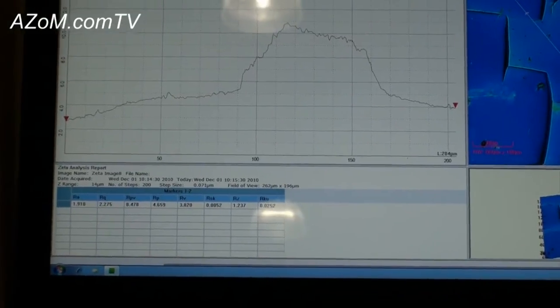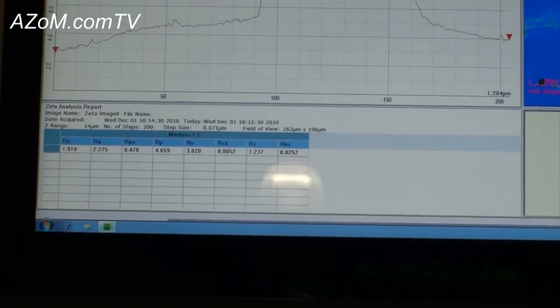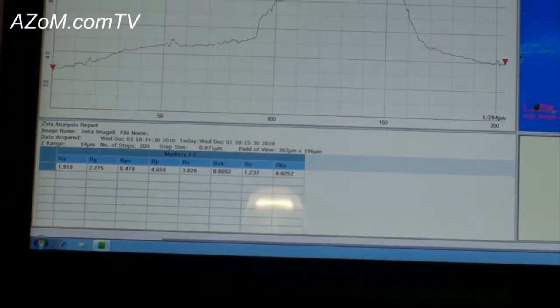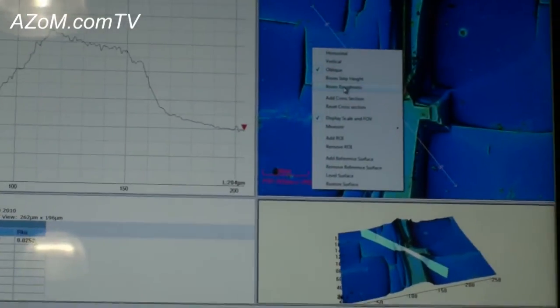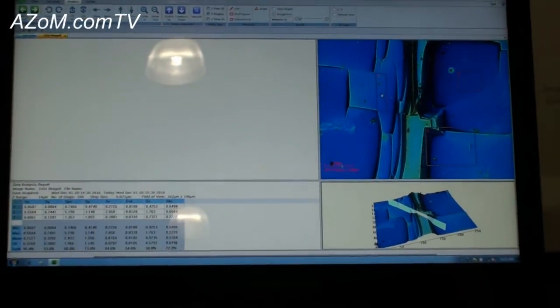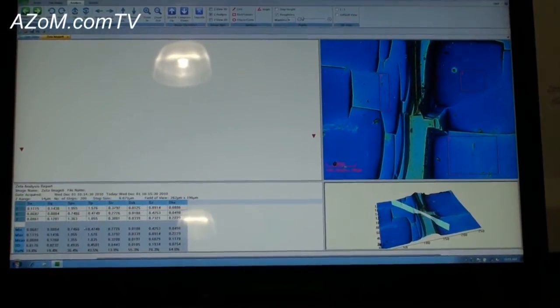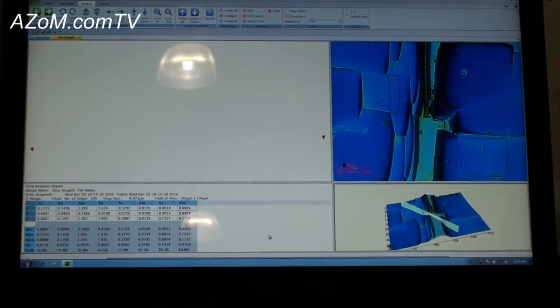Peak valley, and then some of the statistical information about the shape and the distribution. Likewise, I can actually measure these as box step heights or box roughness. So for example, if I was interested in these particular regions, depending on where I put the boxes.